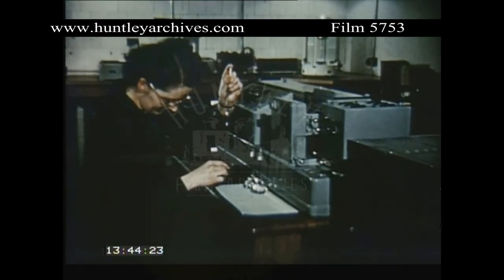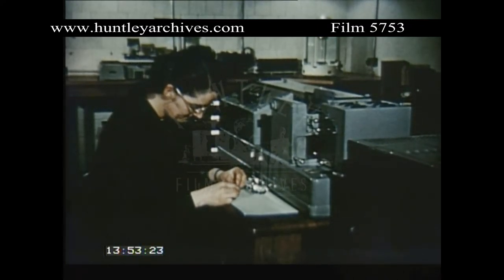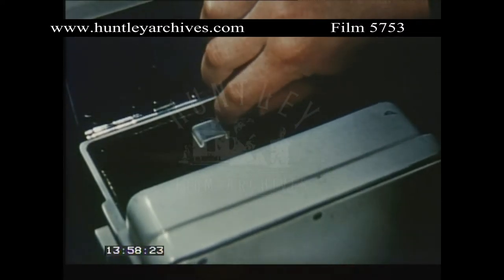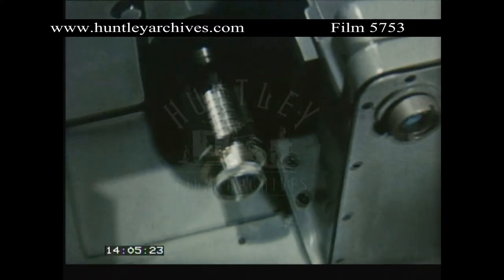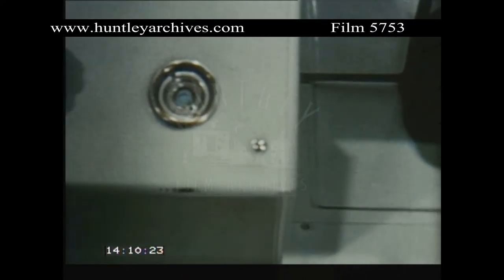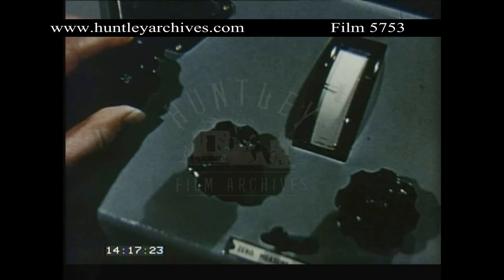Absorption spectroscopy is used increasingly in those industries interested in the molecular structure of materials. Two cells are prepared: one containing the sample in a non-absorbing solvent, the other the solvent only. Each cell in turn is placed in a beam of ultraviolet radiation of one particular wavelength, which is selected by turning a graduated drum. A photocell measures the amount of ultraviolet radiation transmitted, and registers the difference in absorption between the sample and the solvent.